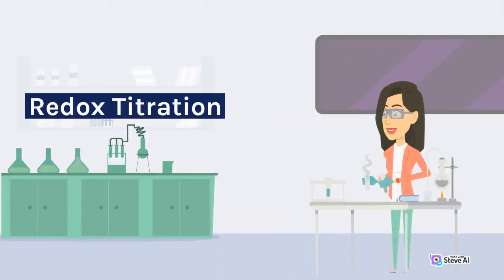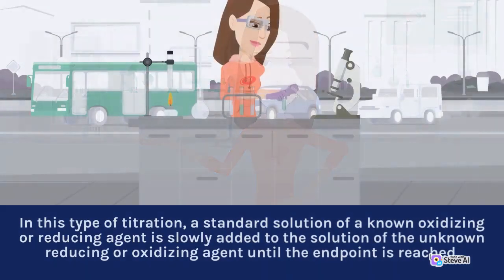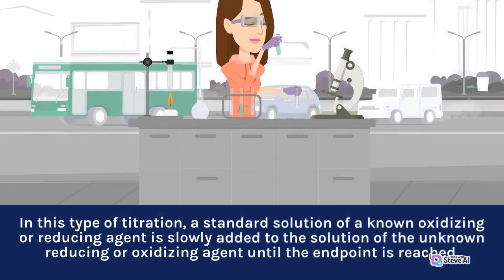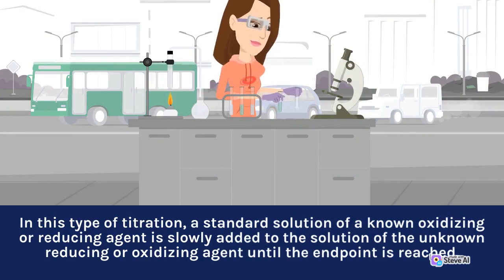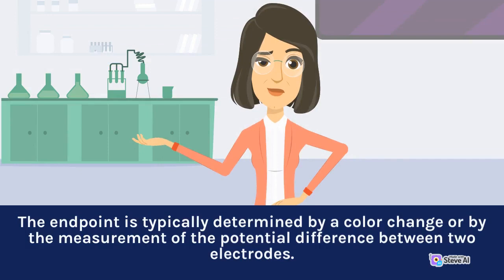Redox titration. Redox titration is a method used to determine the concentration of a reducing or oxidizing agent in a solution. In this type of titration, a standard solution of a known oxidizing or reducing agent is slowly added to the solution of the unknown reducing or oxidizing agent until the endpoint is reached. The endpoint is typically determined by a color change or by the measurement of the potential difference between two electrodes.